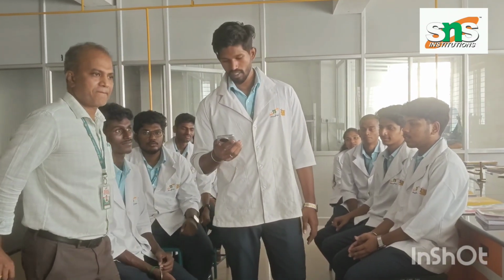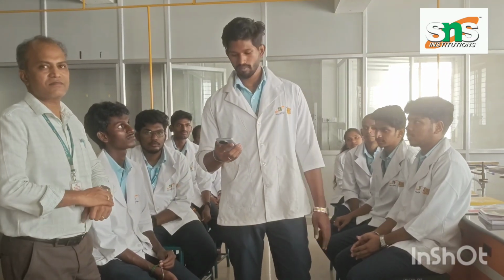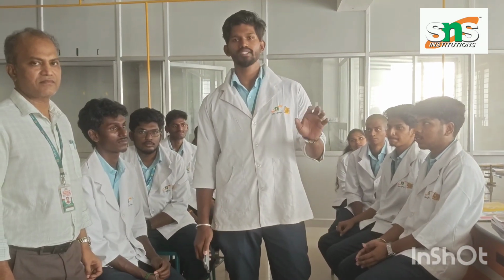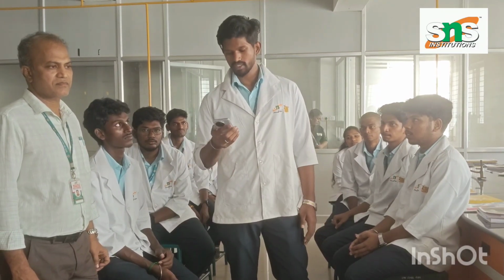Hi, I am Arun Pandyan. My part of sterility testing is ideate. Generate many possible ideas and solutions for the defined problem. Brainstorm innovative ways to improve sterility testing. For example, an automated sterility testing system, improved sterile workshops, faster microbial detection methods, and simplified testing protocols.